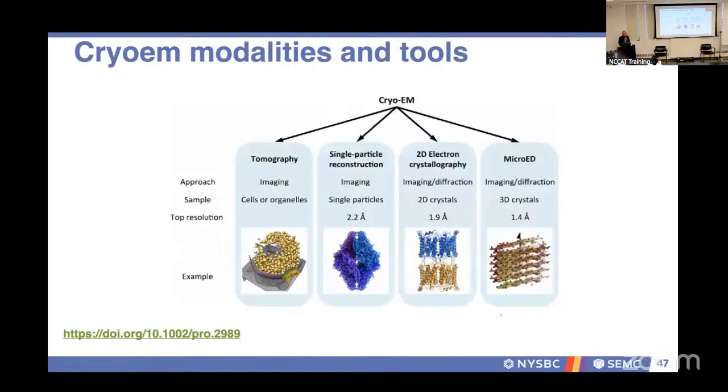So that's really what I want to cover today, in the sense that the electron microscope has four main components. We have your electron source, you have a vacuum system, you have your lenses, and you have your detector. You'll be able to see a lot more of that this afternoon. And one advantage with the practical is that you'll be in front of an electron microscope. You'll have an experienced operator, and given it's your sample, if you want to play with it, you can also twiddle the knobs a little bit and do what you want.